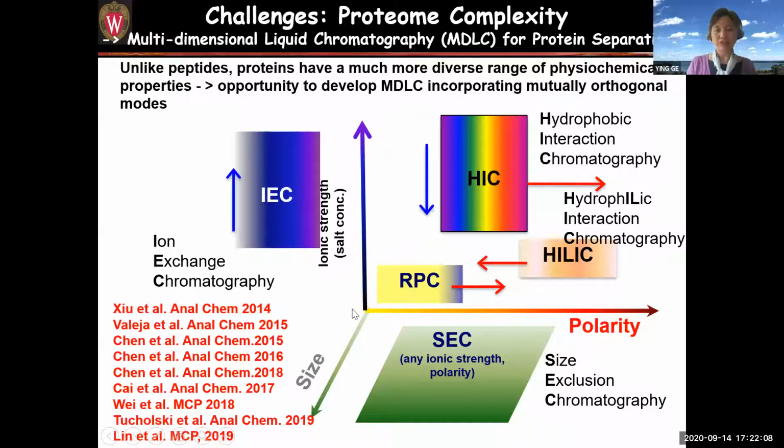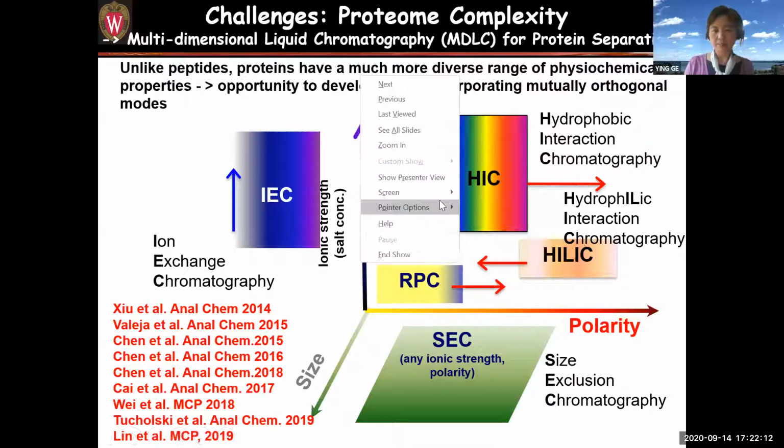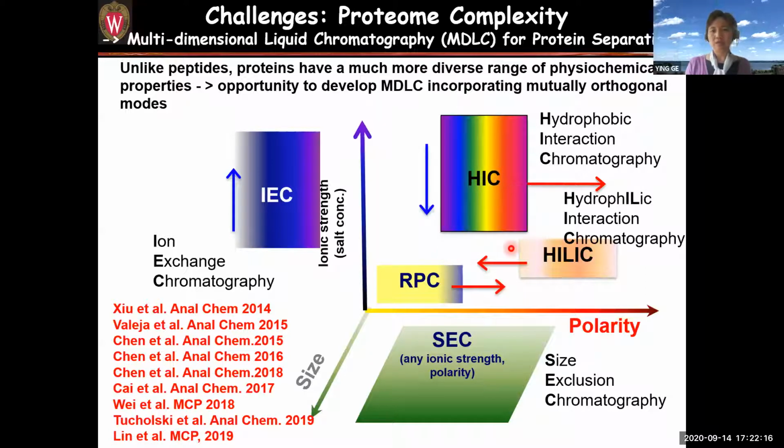Let me actually show the pointer. So most people in the LCMS field know reverse phase chromatography. When we talk about LCMS, they think about reverse phase, but there are several other chromatography modes, even just based on polarity.